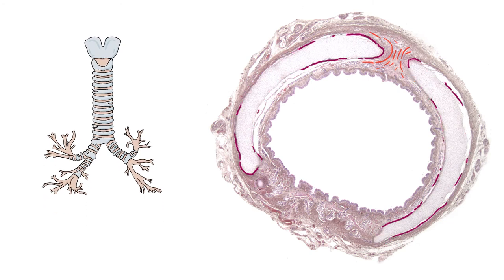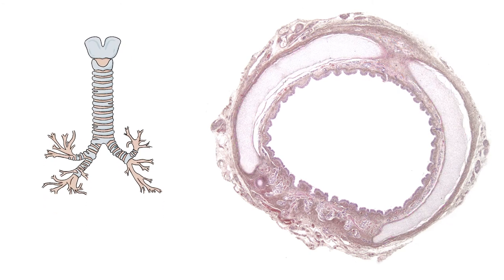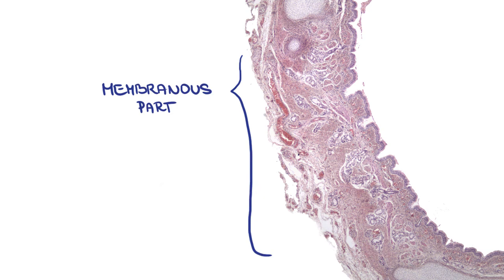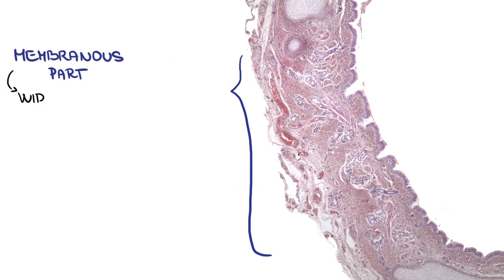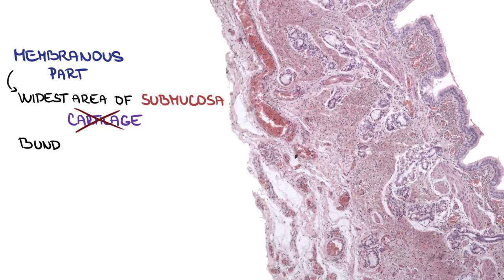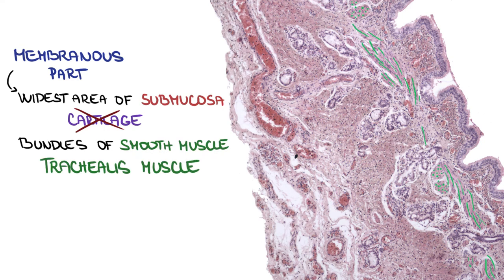The open ends of the cartilage are on the posterior surface, facing the esophagus. There is a membranous part between these open ends, and it's simply the widest area of submucosa without cartilage.